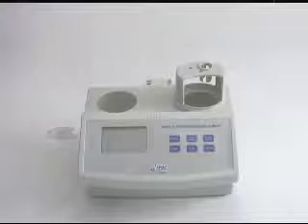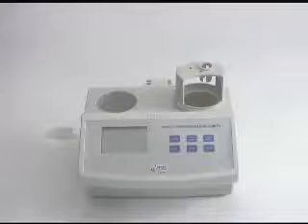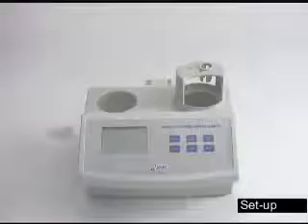Welcome to Hanna Instruments. Today we're going to be going over the setup, calibration, and testing with the HI84102 Total Acidity Titrator for wine. Once you've unpacked your unit, the first thing we're going to do is hook up the probes and tubing set before we start the titrator.